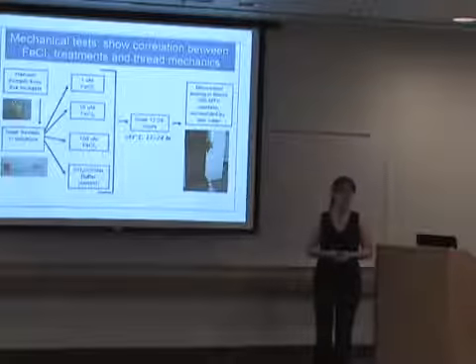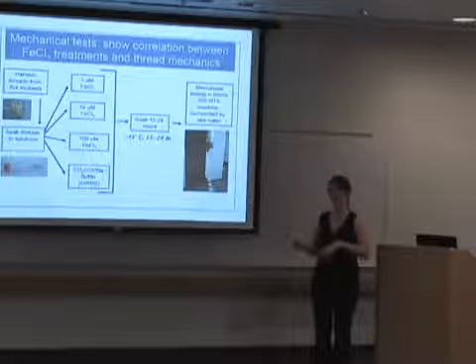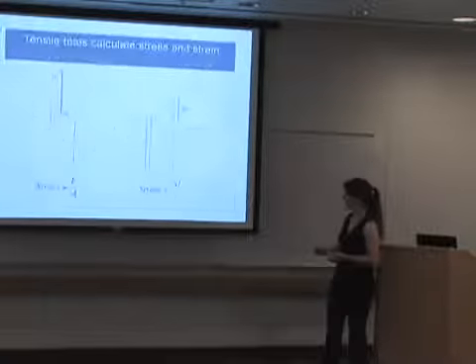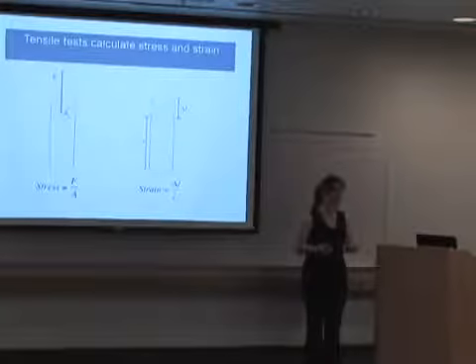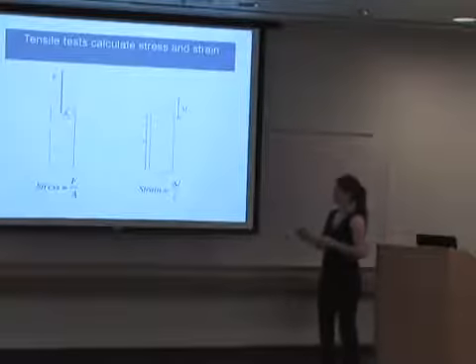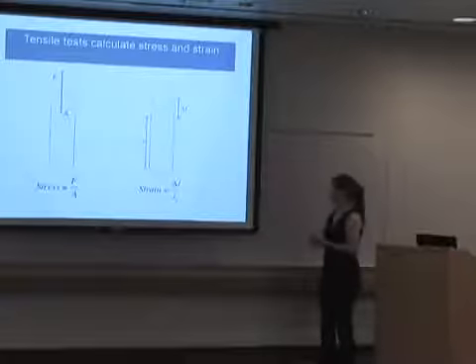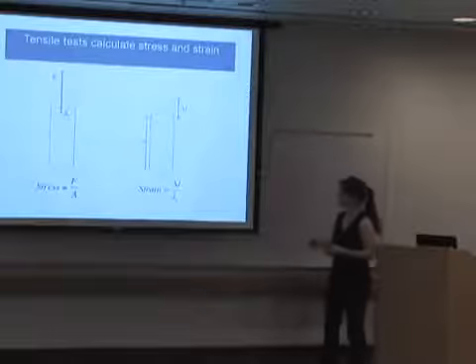All the while, this machine records various mechanical values for the thread that I can use to characterize how the iron treatments have affected its mechanical properties. So just two of the main values that I get out of this machine are stress and strain. They're pretty simple mechanical values. Stress is the force experienced per unit area, cross-sectional area, as the sample is stretched. And strain is the change in sample length divided by the initial sample length.